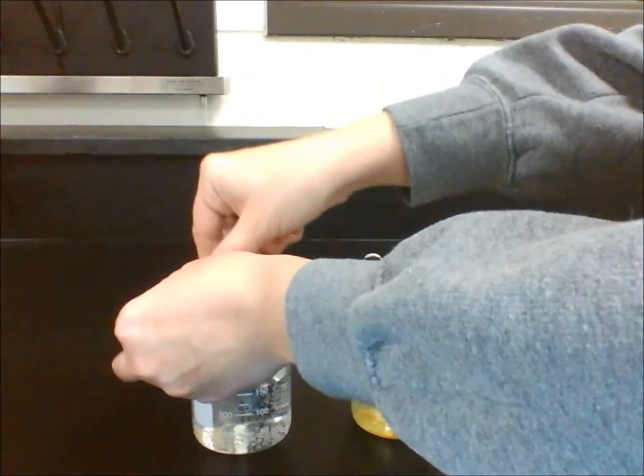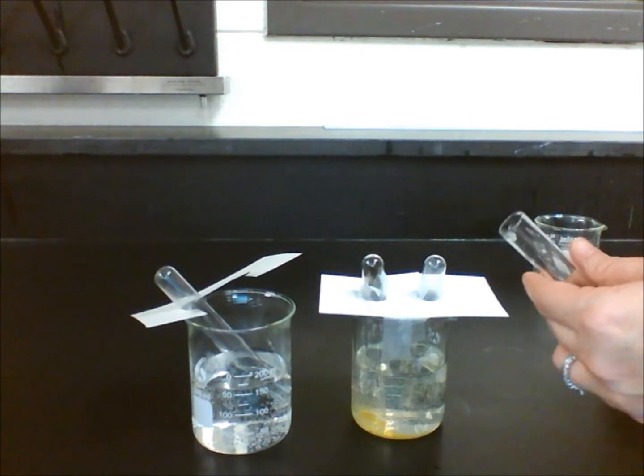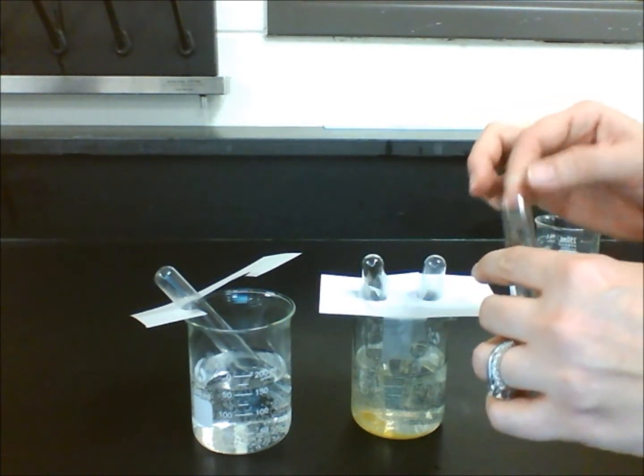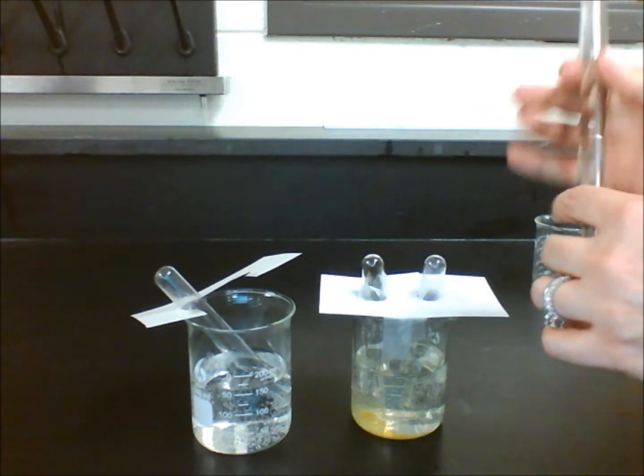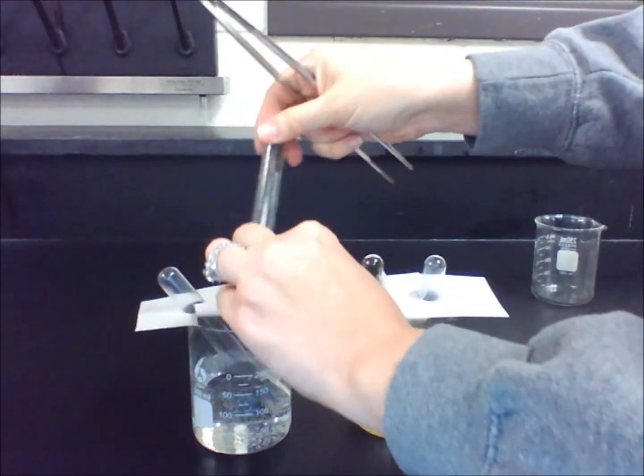Invert one test tube in the water, making sure the open end is on the bottom. We then place a damp piece of steel wool in the test tube, and then invert it as well in the beaker.